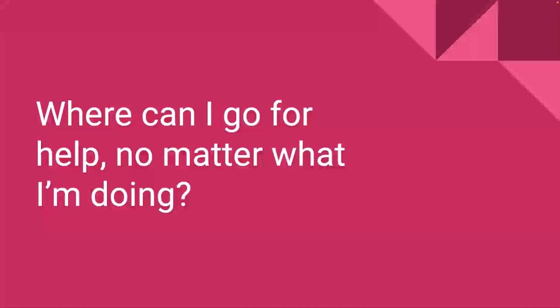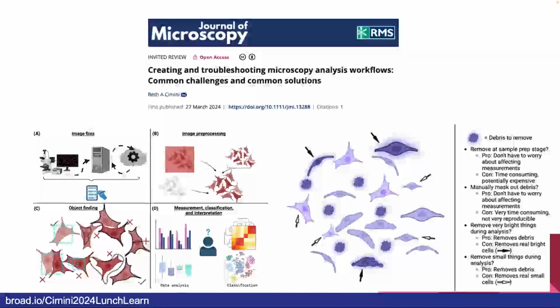And no matter what kind of image analysis you're doing, no matter what your images look like, we recently put out an open access paper in Journal of Microscopy about common microscopy problems and common solutions, and best practices on how to think through how to set up your image analysis in general, and how it interacts with things like your sample preparation and your imaging.